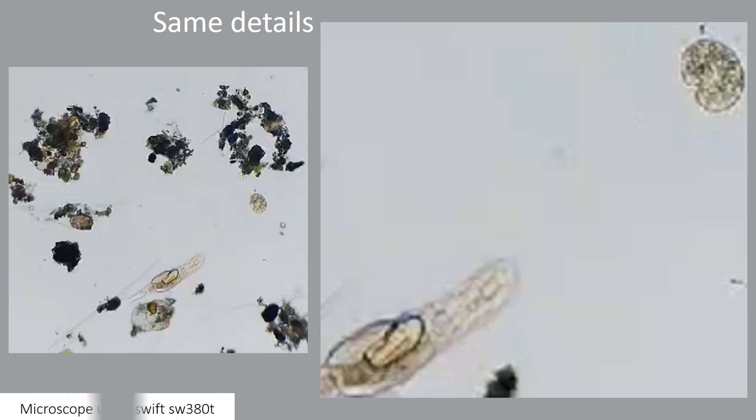Useful magnification is when magnification actually reveals more features. For example, the image on the right is much larger, but it has the same amount of details.